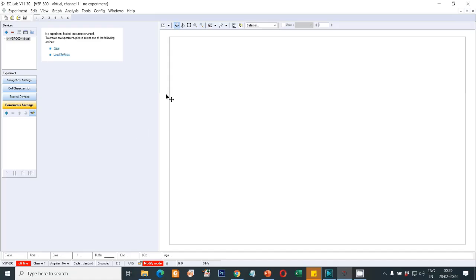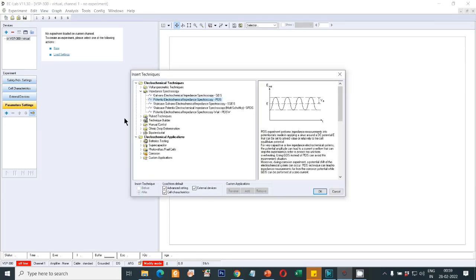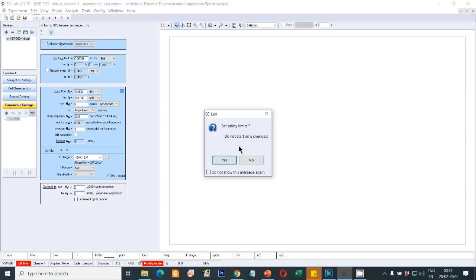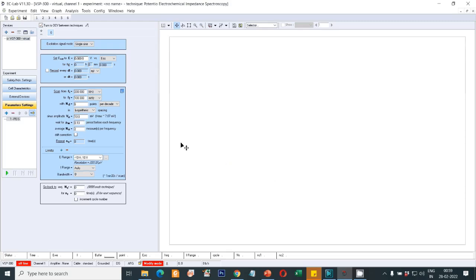Let's begin with the EIS experimental interface and various parameters associated with it. As you can see, this is the EC Lab software EIS interface, and these are the various parameters which are very commonly used during EIS measurement. FI and FF are the frequency range, and it is generally selected from 100 kilohertz to 10 millihertz, but you can change it to a different frequency range as per your requirement.